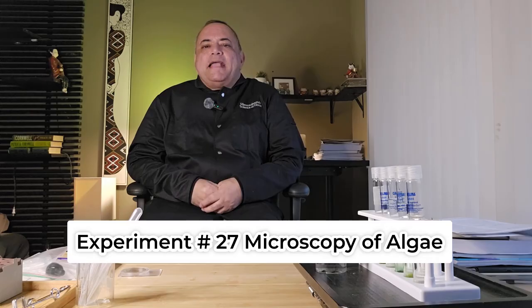In today's episode, we're going to look at the microscopy of algae. Algae are also known as protists. Protists are a diverse group of eukaryotic microorganisms that typically do not fit into other kingdoms like plants, animals, bacteria, or fungi. They have a nucleus and other membrane-bound organelles.